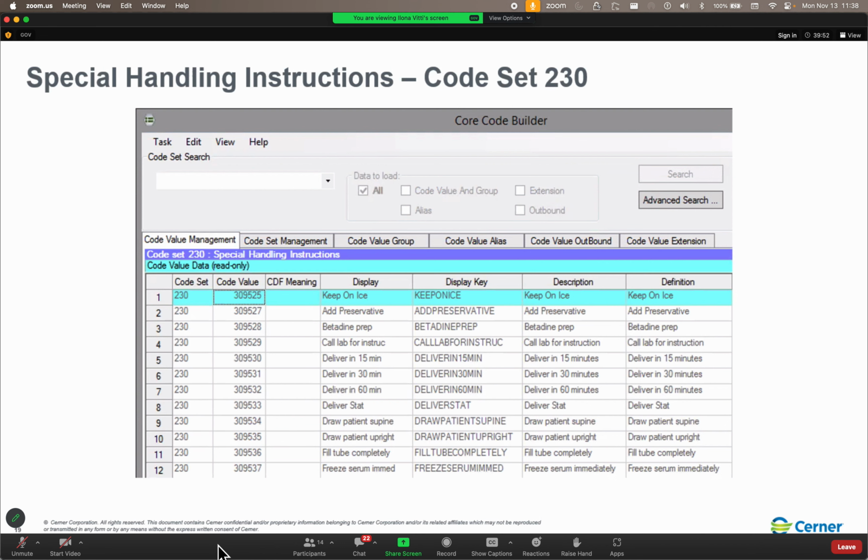No, you don't. What happens is that that accession number will still be assigned. However, you won't actually be able to open it in our front end applications until the sequence length is increased from 4 to 5, because there's just not enough spaces for all of the characters.